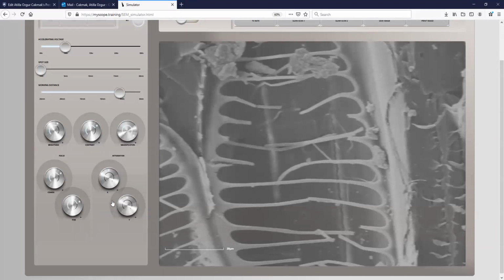That's the sweet spot. And you can work around with the astigmation tools to get a slightly better image. These magnifications are not drastically large to really start feeling the importance of astigmation yet, but still, stigmation tools are quite important.